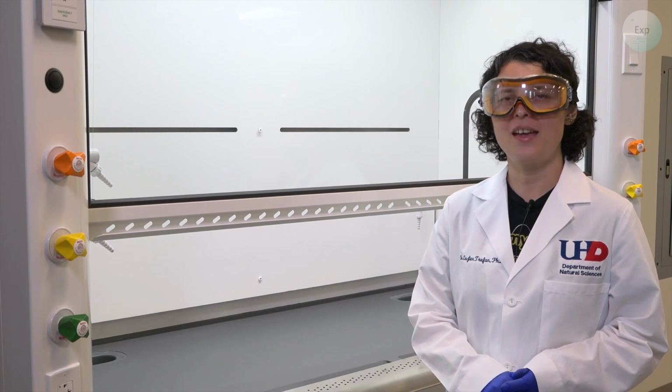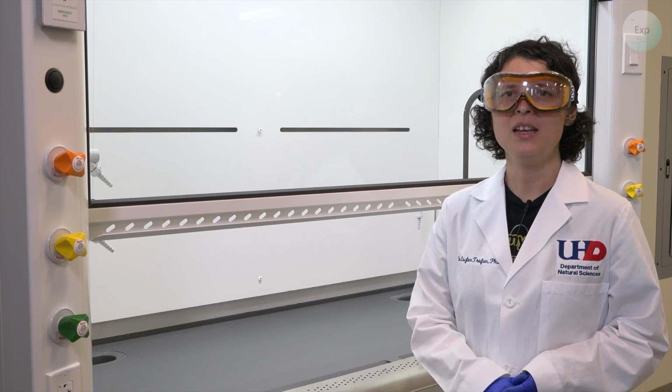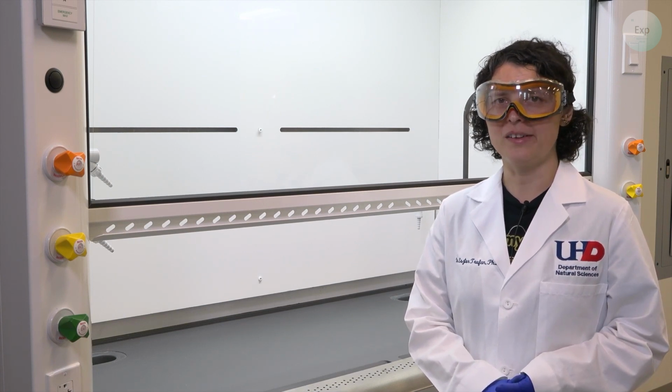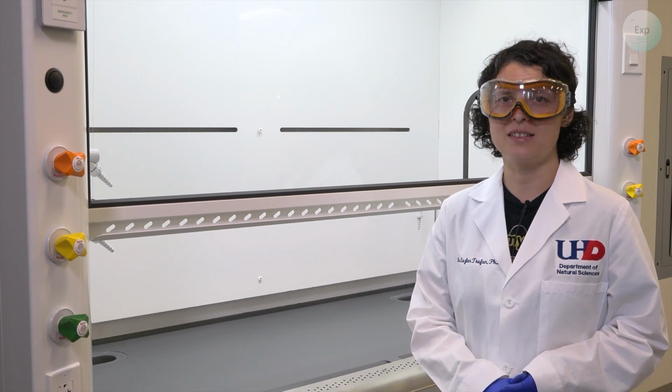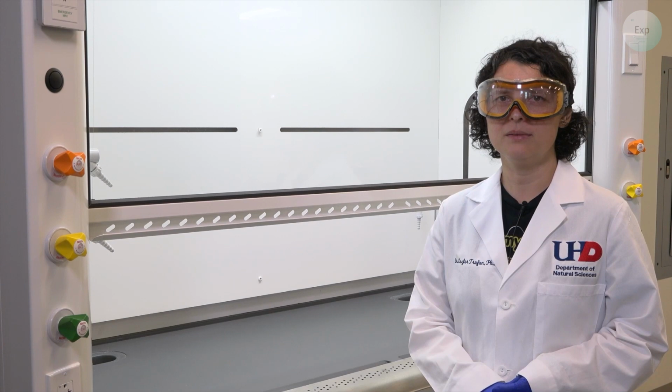This is Dr. Esther Trufan, and in this video, I'm going to demonstrate how to make a 0.1 molar acetic acid solution. For this experiment, I am going to use deionized water and glacial acetic acid. The concentration of glacial acetic acid is 17.4 molar, and so that is a very concentrated acid.